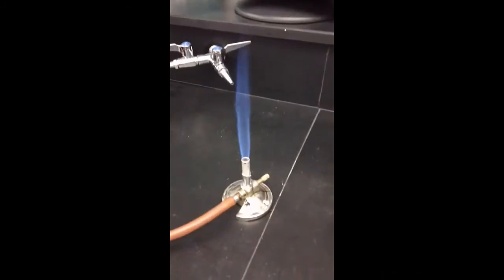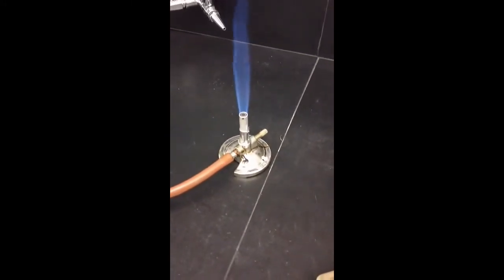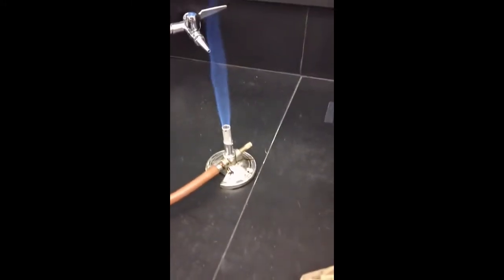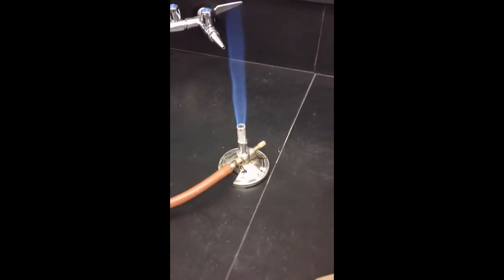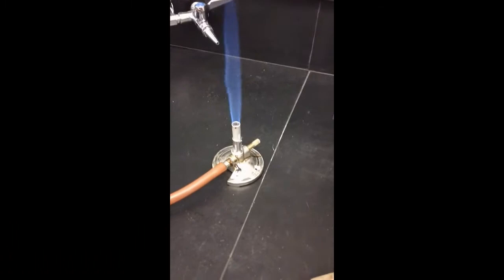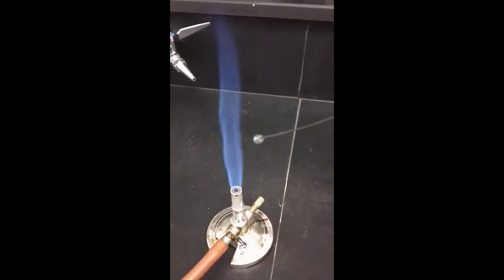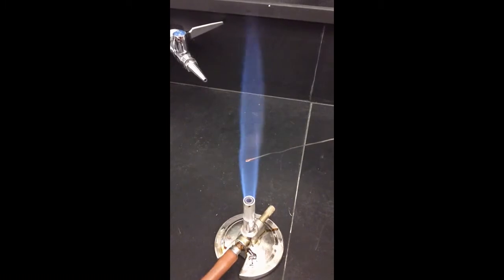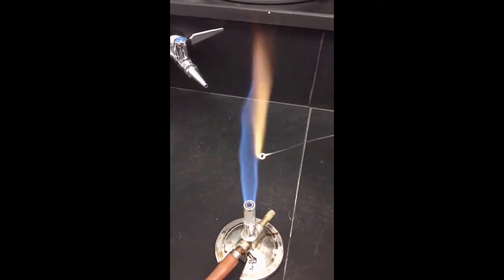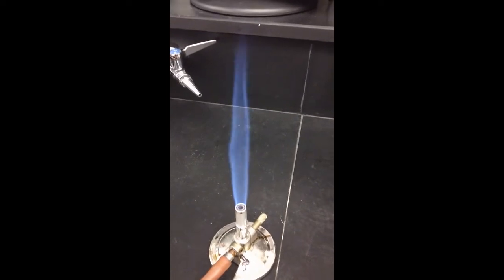This is under the test 1, test A, and I am going to start with Cr. So this is Cr is what you're writing your observations for. I'm making sure that I have a full little bubble there. And pay close attention. Record what you see. I'm going to do it one more time so you can see it.